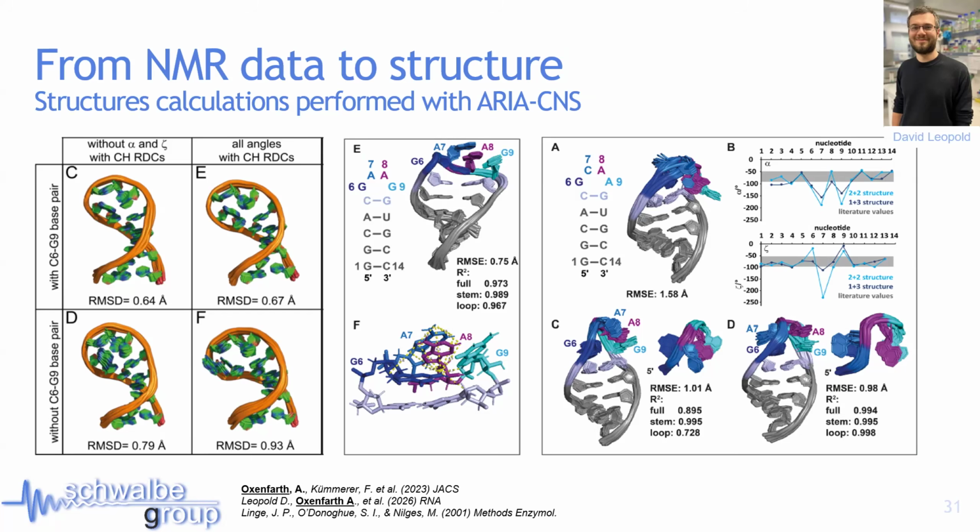And for GCAA, actually, we have here a somewhat usual GNRA fold. But if we look at the RDCs for the loop, we see they're actually not in that good agreement with the structure. So again, we know we have averaging. The RDCs say, we're not happy with this.